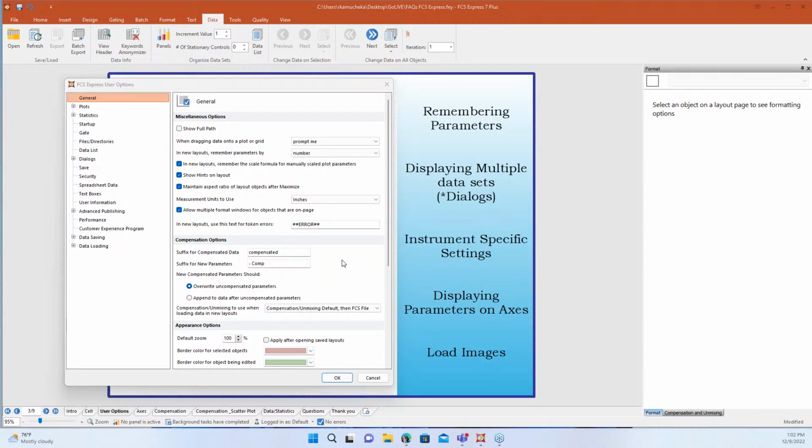So in some of our data files, we have the ability to store what's called data sets. LMD files are a perfect example of that. Inside those LMD files, you get two different data sets. We also have other instruments that do the same strategy and tuck data sets inside of there.